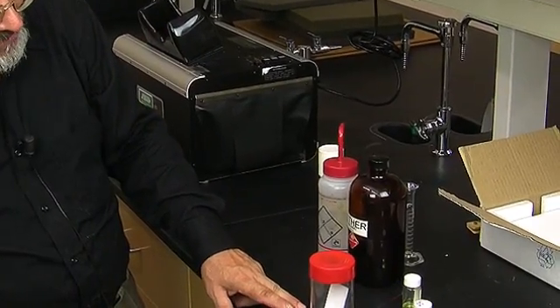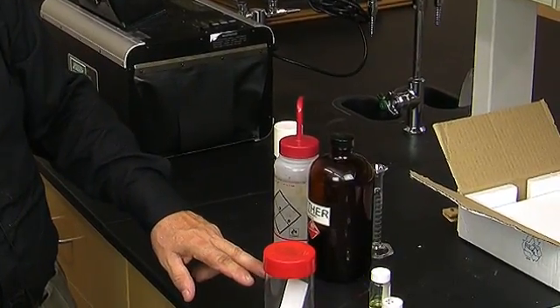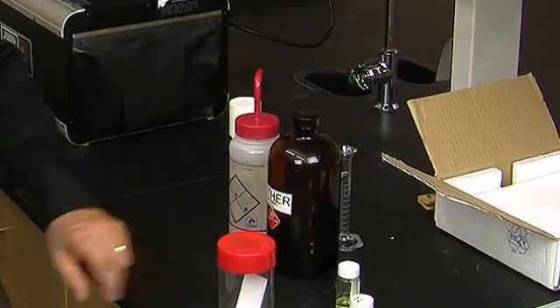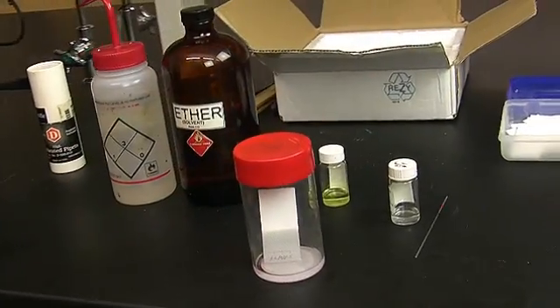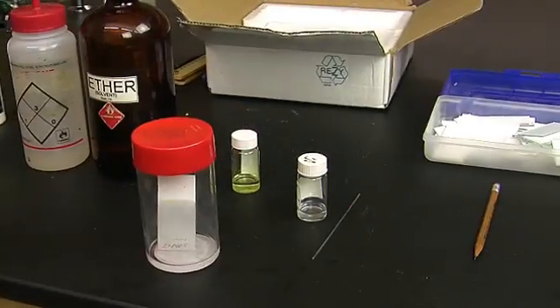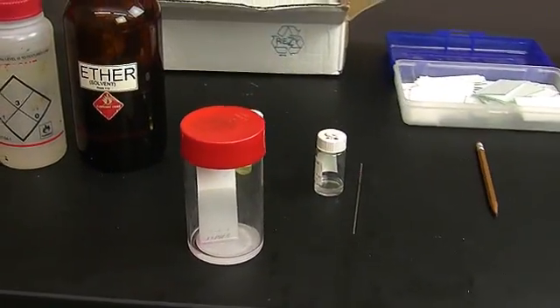Now we're going to let the solvent rise by capillary action up through the TLC plate until it gets to within about a centimeter of the top. We've let the solvent run up to within a couple of centimeters of the top of the plate.